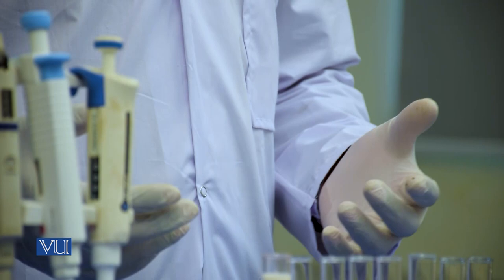So in order to perform this experiment, we need aseptic conditions. For that, we will perform this experiment in laminar air flow so that we can maintain aseptic condition. So let's begin with the experiment.